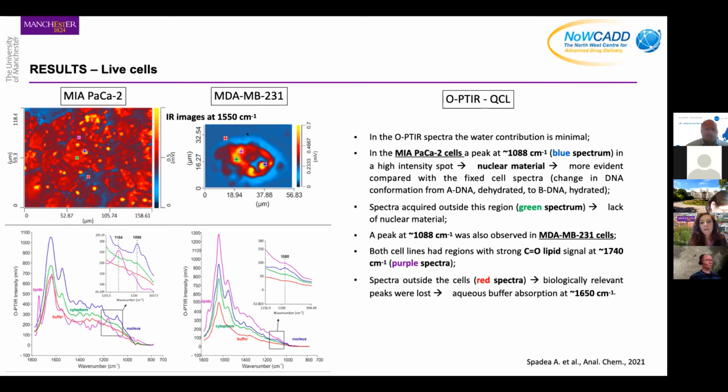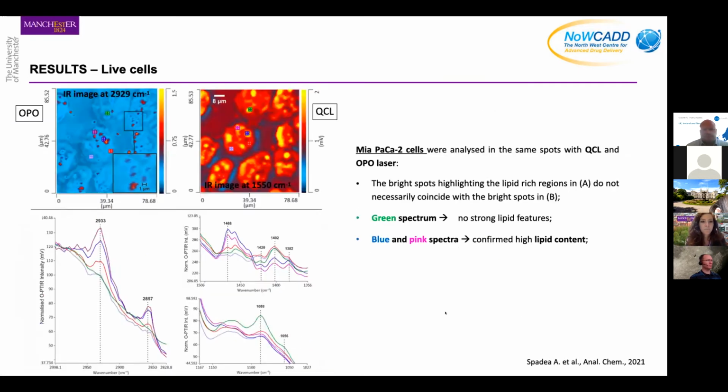And then with the MDA231, I did exactly the same thing, and everything I saw with the MIA-PACA was also observed with the MDA231, confirming the reproducibility of the technique.